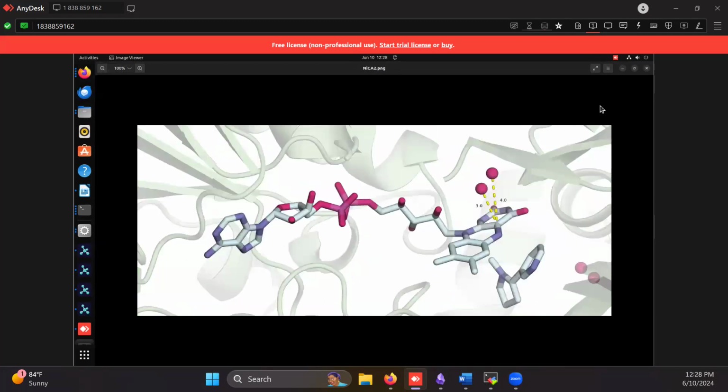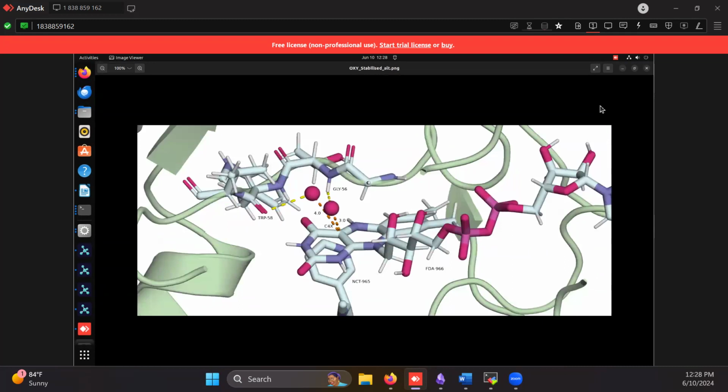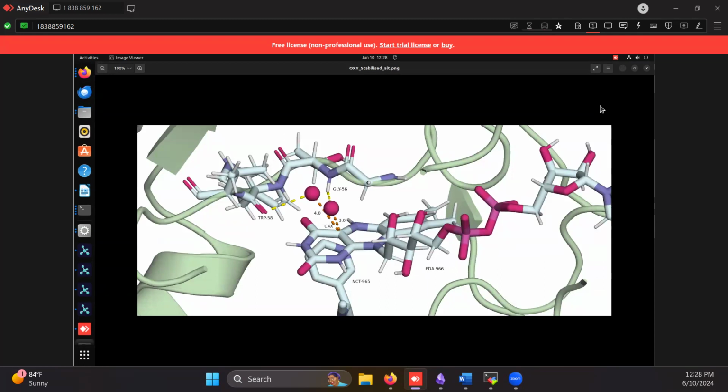This is a different angle, which may not show as much contrast, but very clearly shows the oxygens much better than this. But this shows the residues much better and shows the coordination of the ligands with the oxygen. So I think going through a few iterations is good, because if you want to have this as a published image, putting in some time is good, because that's going to be around forever.